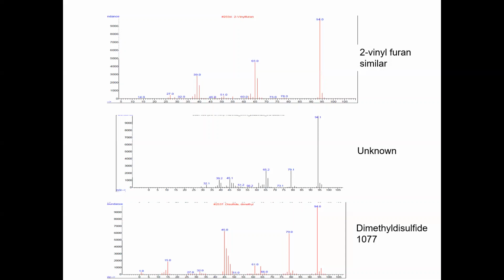There's really some nice books on this, something like reading for evening, whatever, that tell you how to interpret these, how to know molecules, weak bonds, where they break. I mean, a good chemist will sit down and say, oh, I know that fragment, I know that piece, that's logical, and so on. I don't have that knowledge or skill at all. I have to look and say, looks like a good fit, it doesn't look like a good fit.